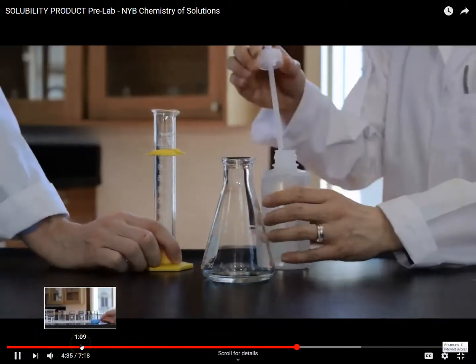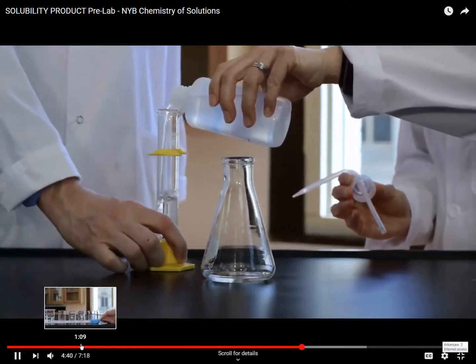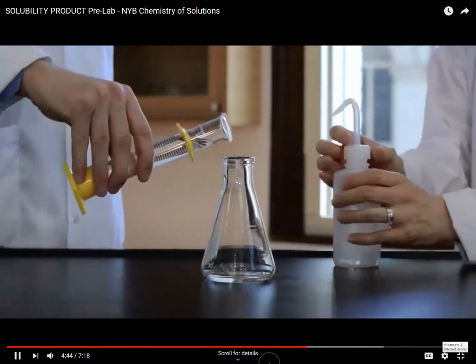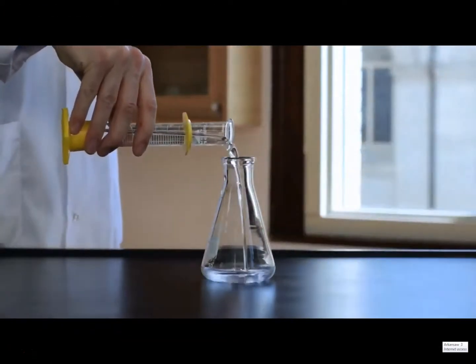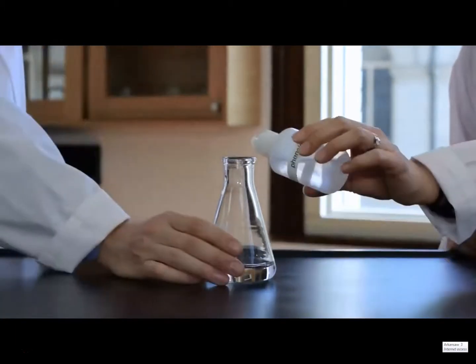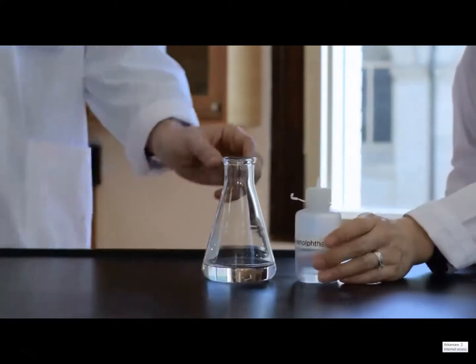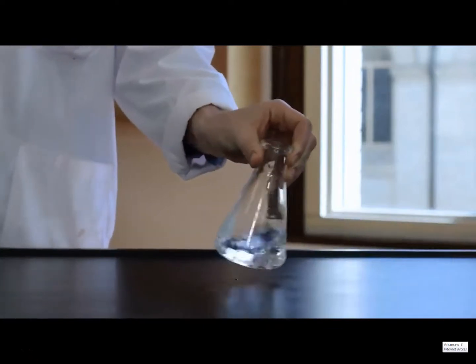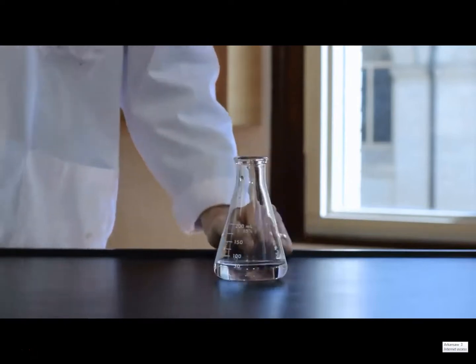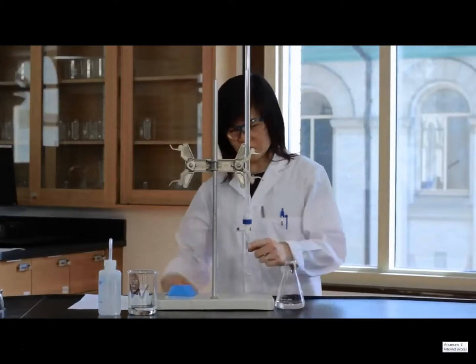Add about 50 milliliters of distilled water, five to 8 drops of phenolphthalein, and then titrate with the standard sodium hydroxide solution to the end point.